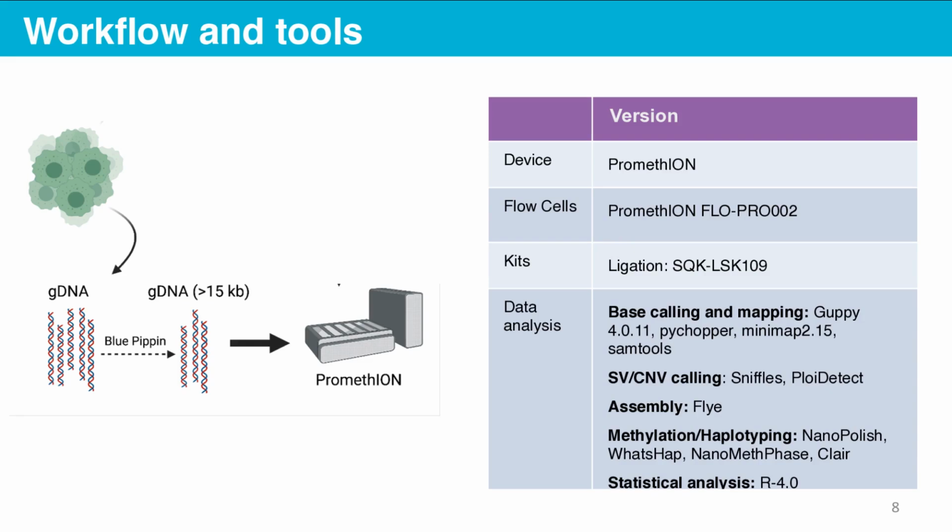To approach this, we studied the whole genomes using nanopore sequencing. In our workflow, we extract DNA from the cervical tumor and size select the genomic DNA using BluePippin to get segments of DNA that are greater than 15 kilobases. And these are then sequenced on the PromethION.